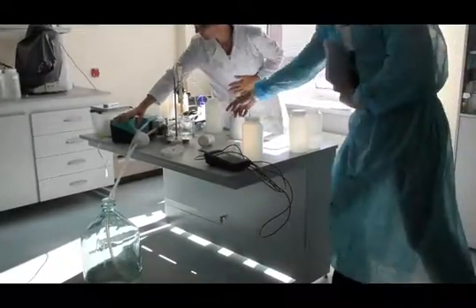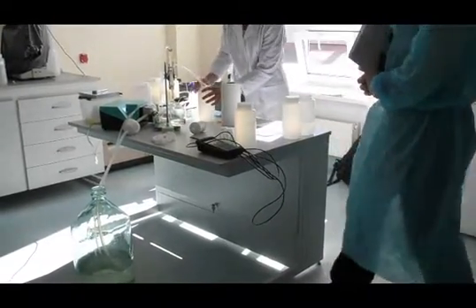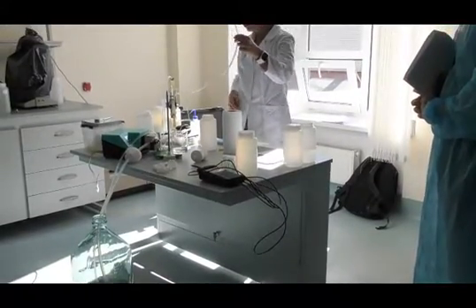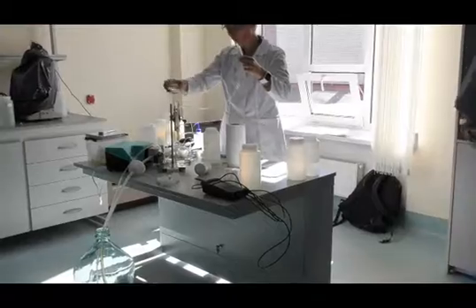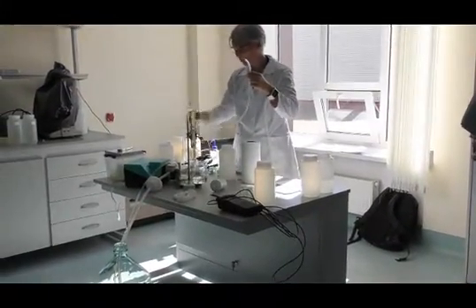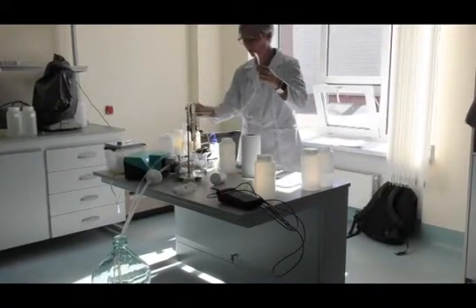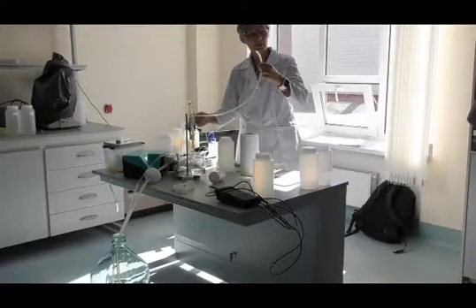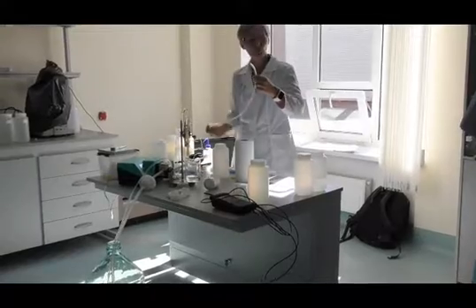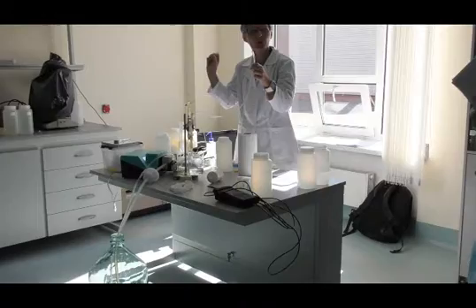Then we can start up. But it's not coming yet, because as you see, there is no sample coming through the tube, even though the sample is going through the system here. We need to put on pressure against the water flow to press the low molecular mass fraction out in this tube. Now the sample is just going through the tubes, and we want it to go through the small pores.